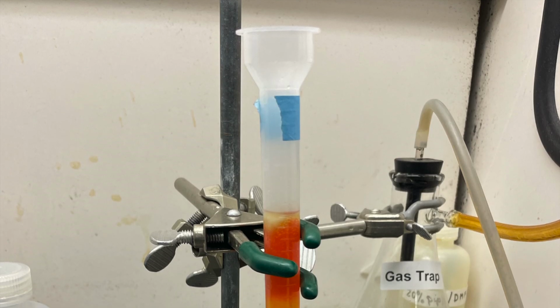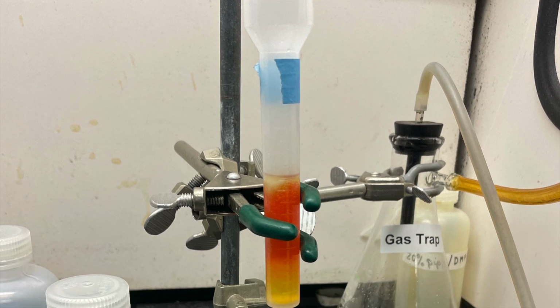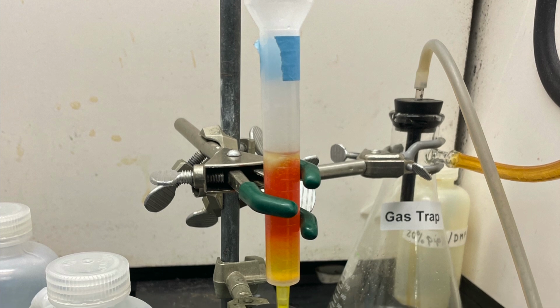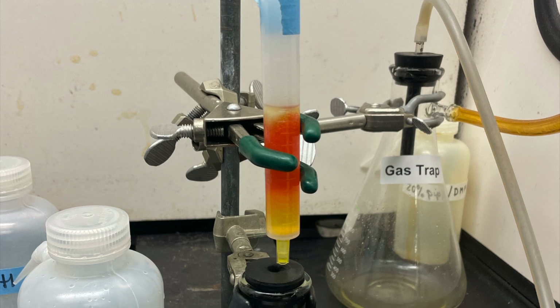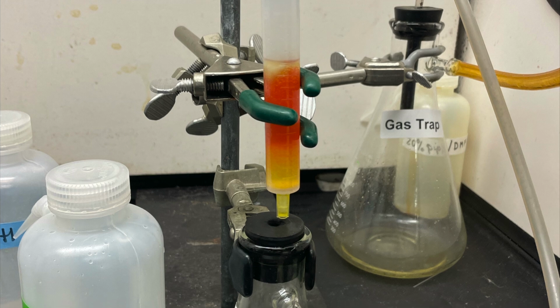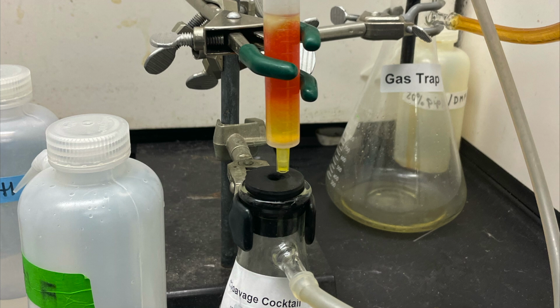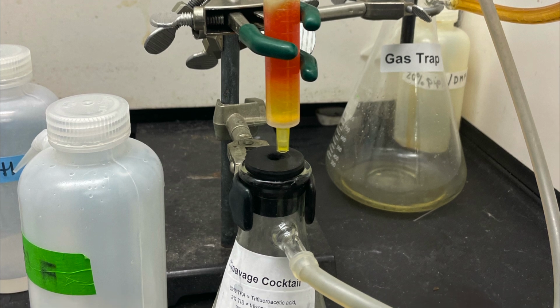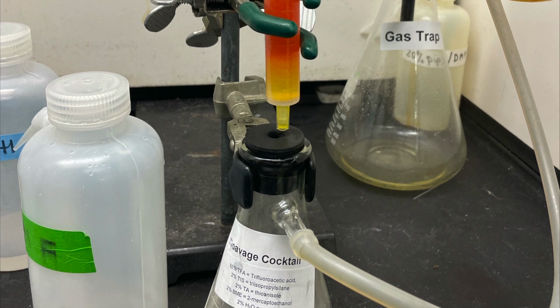The scaffold is getting torn apart from the peptide itself using a really strong acid, which has a really cool orange color. The resin is a solid, a pale yellow type of thing at the bottom. That's the resin there.